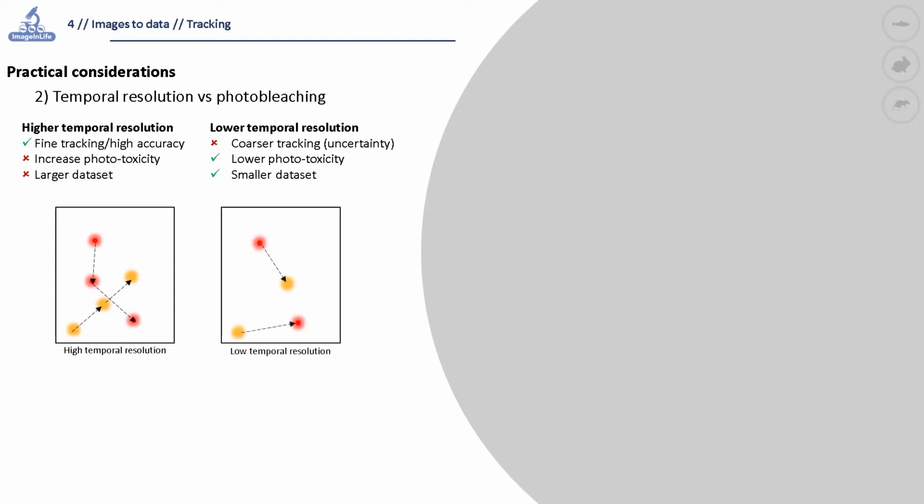If we now reduced the time resolution such that only the first and third position of each particle would have been captured, the nearest neighbor search would have connected the wrong particles when reconstructing the tracks. This linking error might be obvious for a human, especially if the two objects have different aspects. However, in most cases, the algorithm relies only on current and past positions of the particles to reconstruct their track.